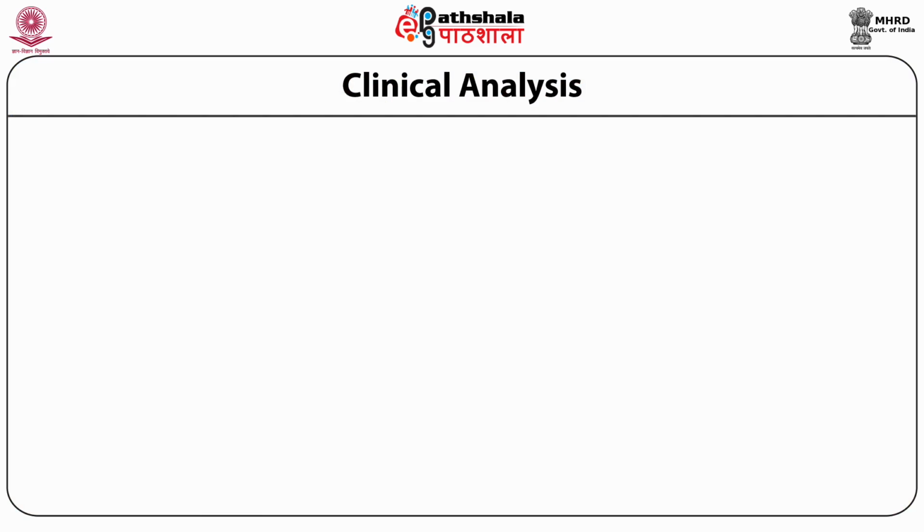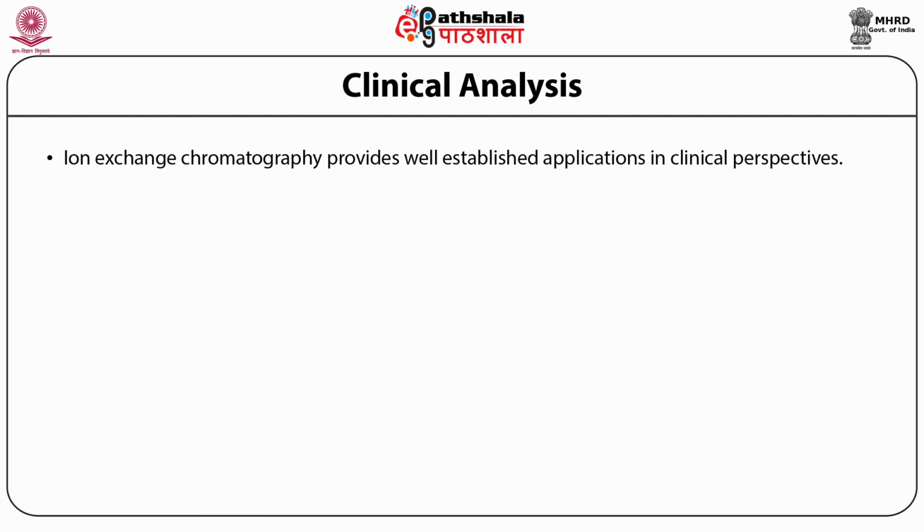Clinical analysis. Ion exchange chromatography provides well-established applications in clinical perspectives. It provides a huge range of prospects for selection in mobile and stationary phases. It aids in solving distinct separation problems when combined with various detection techniques.